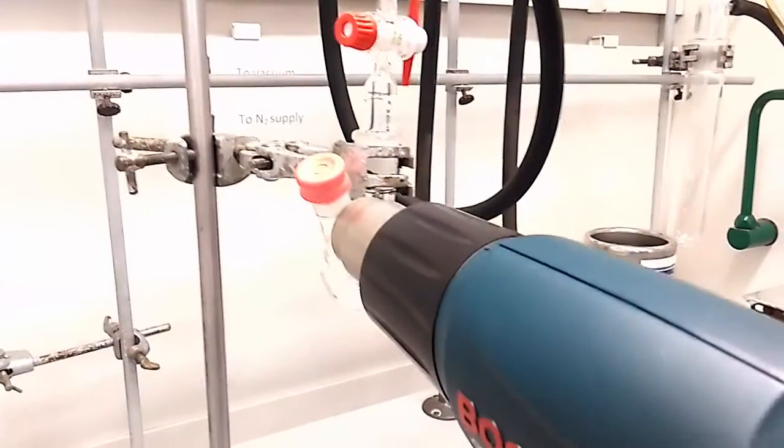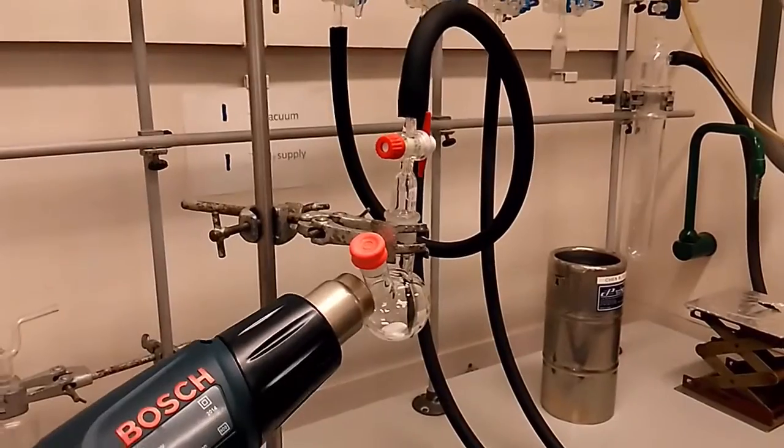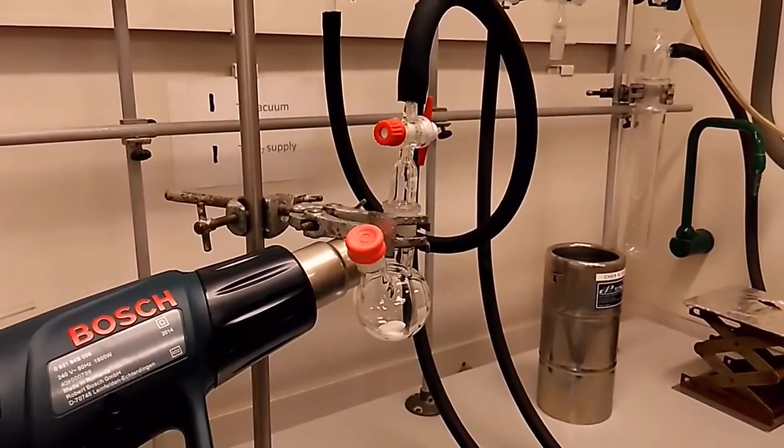So in this process under vacuum, the water will be turned into vapor. Any solvents will be vaporized and goes up into the Schlenk line away from the system to the vacuum.